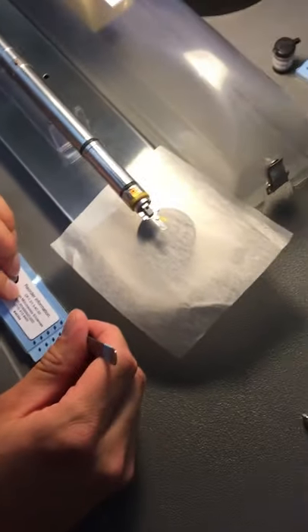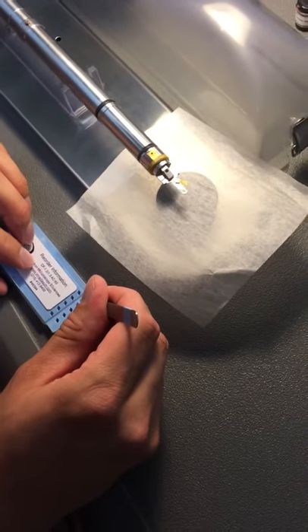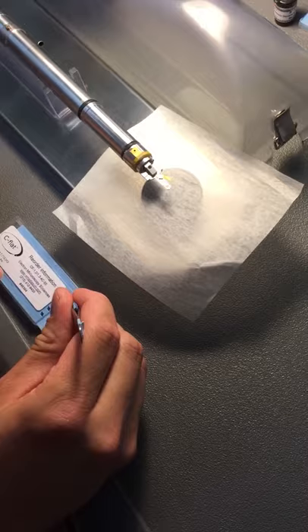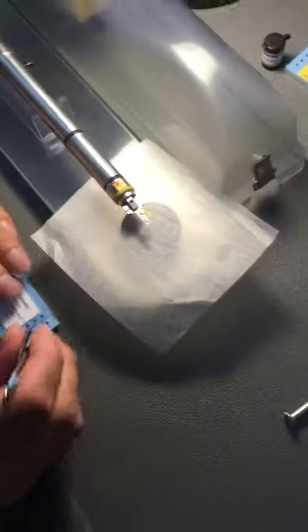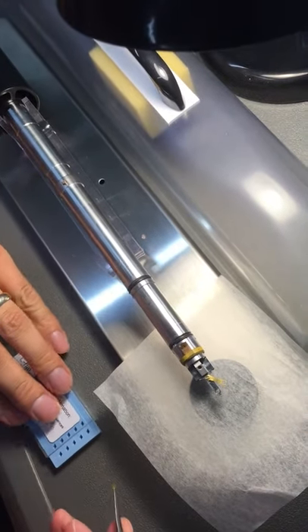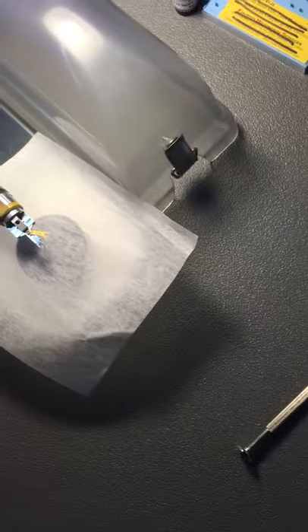Oops — that's fine. I grabbed a little too much of that grip.